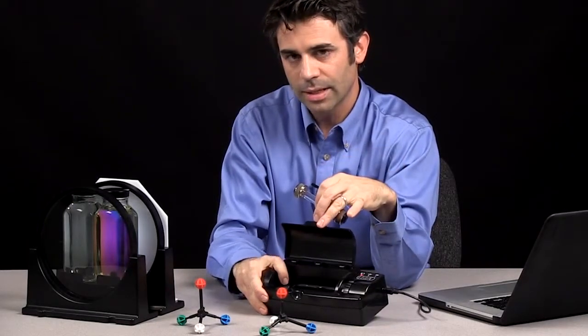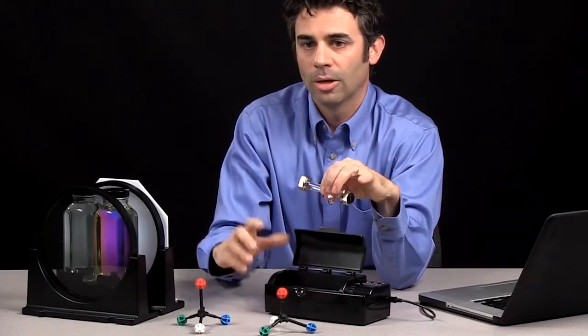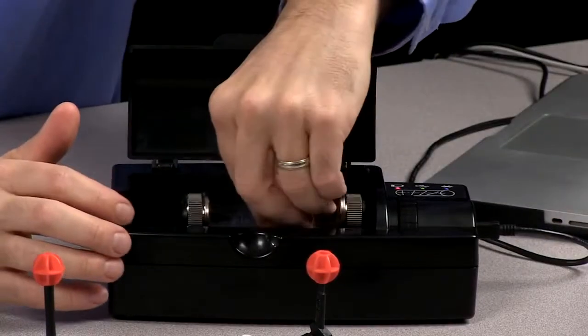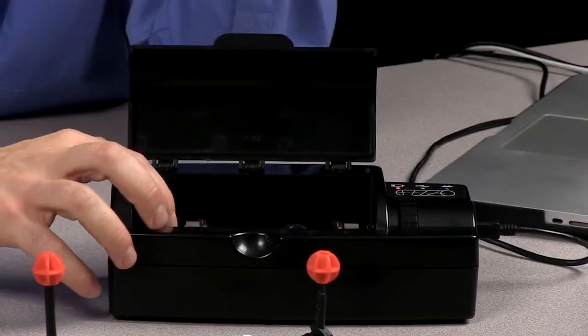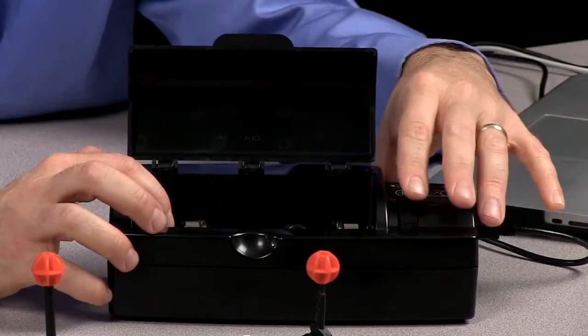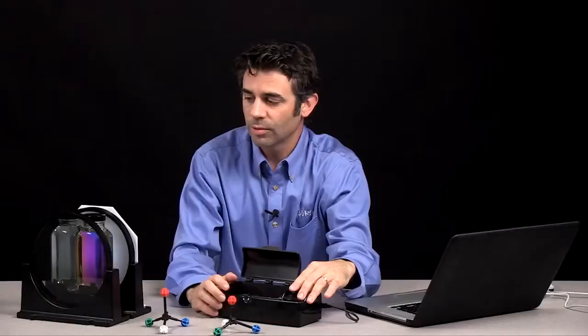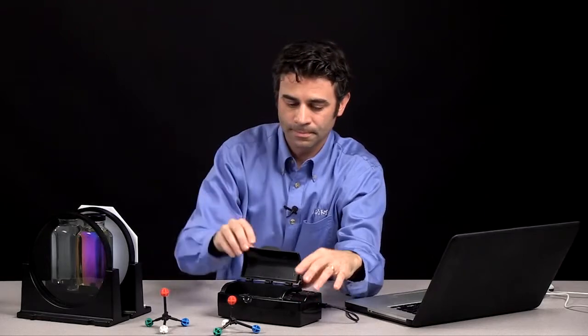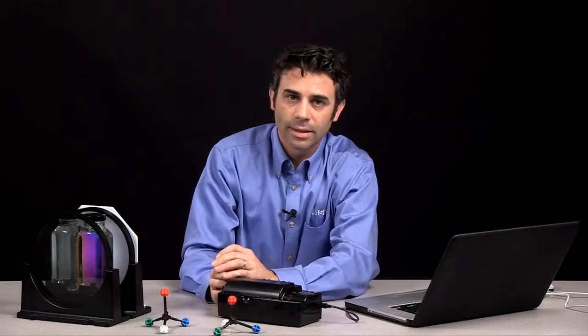In the polarimeter, there is a 589 nanometer monochromatic light going through a polarizing film on this end and a polarizing film on this end in front of a detector that I can rotate around, just like I could rotate this around. So I have monochromatic light that's getting plane polarized, going through my sample, and hitting a detector.